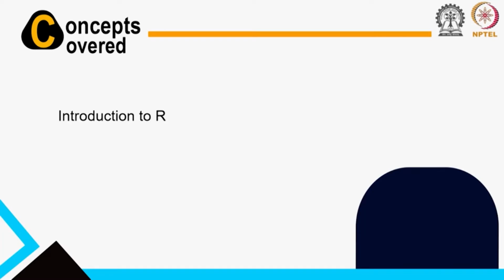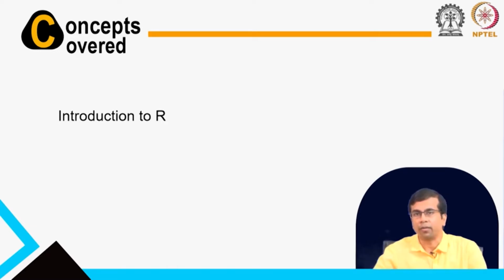So, today's agenda will start with talking about a programming language called R, right. This is a platform where we can do a lot of statistical analysis. A lot of the packages are built on this R platform, and we have talked about it when we were talking about the analysis part, right. In the theory, we mentioned, right, there are packages that are implemented in R, and we will see, right, there are so many tools that you can use for doing this transcriptomic analysis.